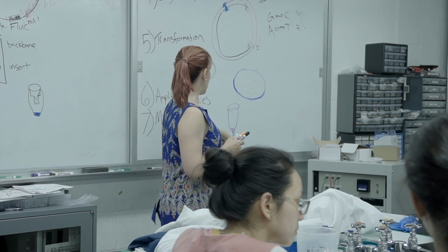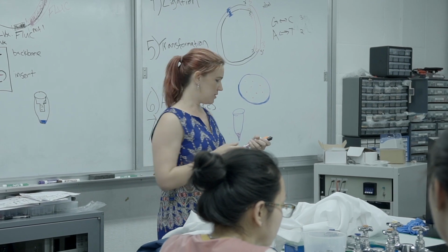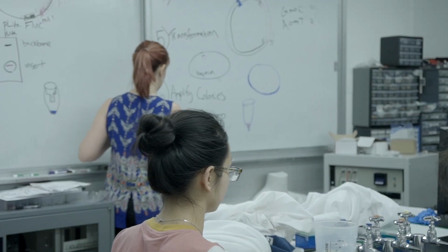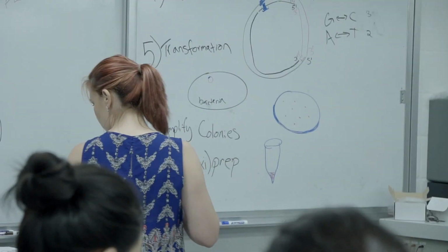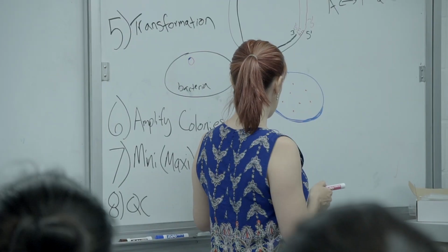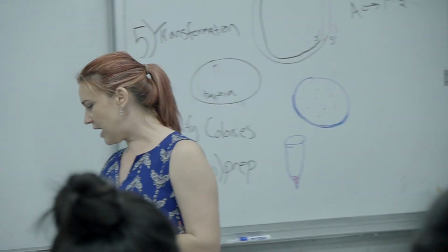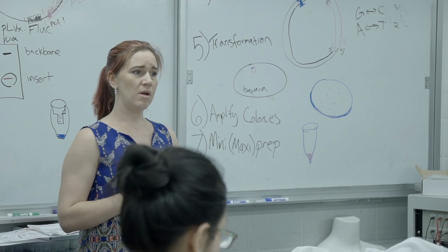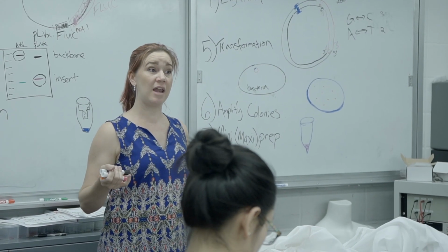And now I need to do one more step because I don't know if it's the right one, right? So the very last step would be to QC this, quality control it. There's a couple ways I can do that. So let's say I have 4 of these tubes, and I want to know if 1, 2, 3, or 4 is right. So does anyone have an idea of some of the QC I might do? One QC is I want to make sure there's clean DNA in there.